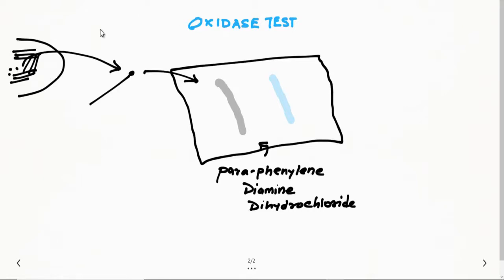In the oxidase test, we take a pure isolated colony with a loop or stick and make a streaking line on filter paper. This filter paper is already impregnated with a dye known as para-phenylene diamine dihydrochloride.